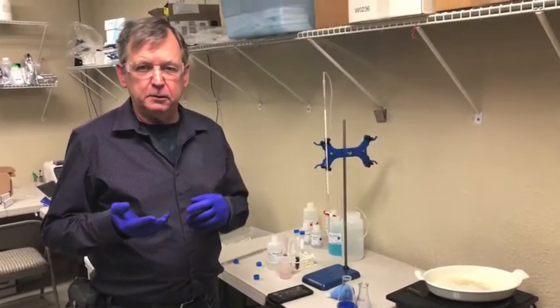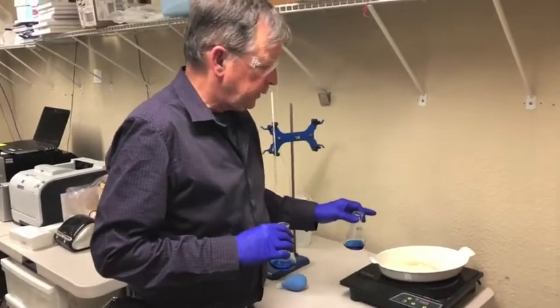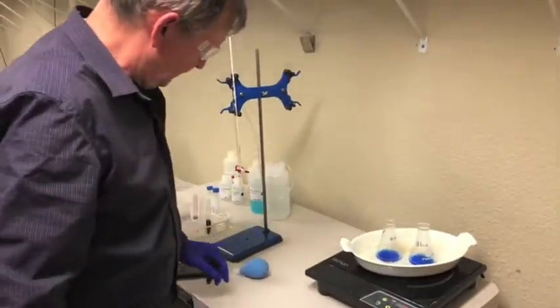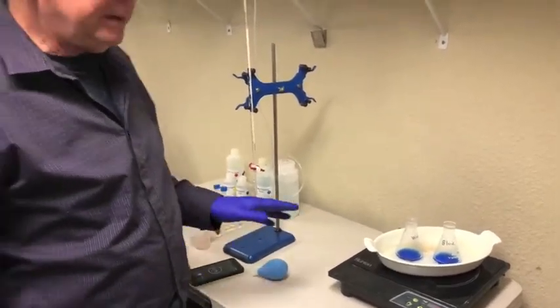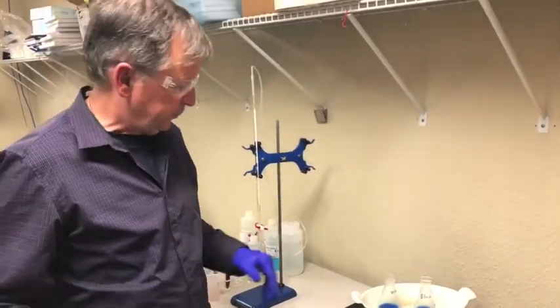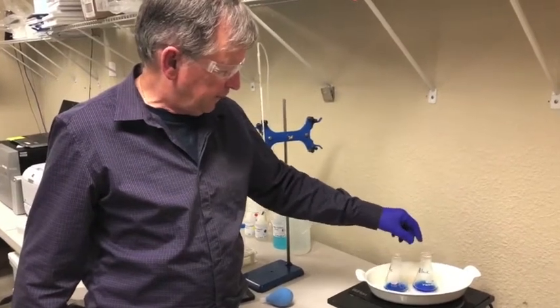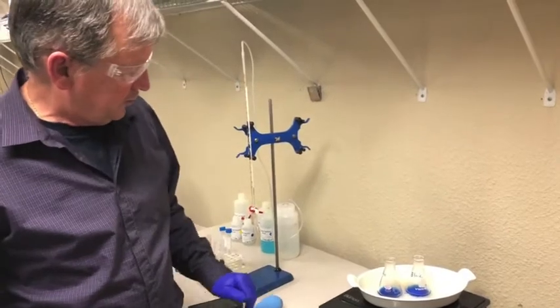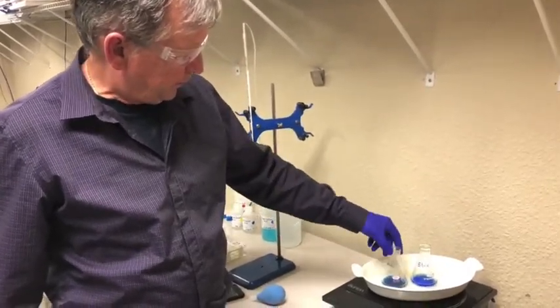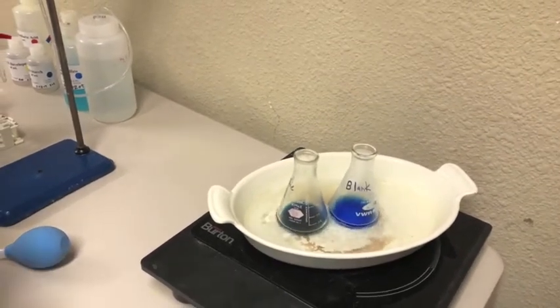Our samples are ready — water added to the blank, wine added to the sample flask. We're going to put these in a slowly boiling water bath; it doesn't have to be super fast but needs to be at or near boiling temperature. I'm starting a two and a half minute timer — you want this to be pretty exact, as going much longer or shorter will increase inaccuracy. Give these a little swirl every so often. Over the course of two and a half minutes, if there's any appreciable sugar you'll see a decrease in the blue color and a reddish color appearing — you can already see that happening in the wine sample.